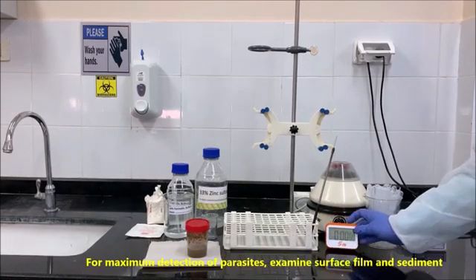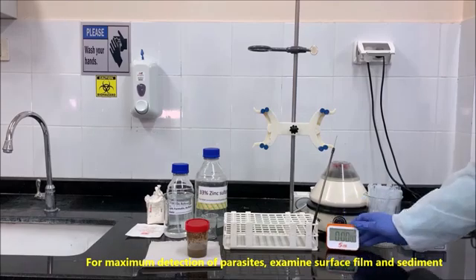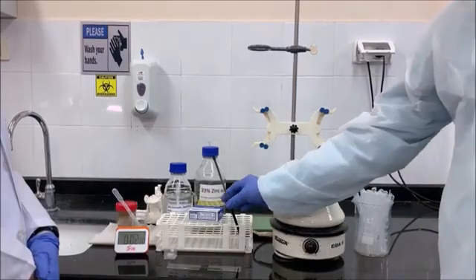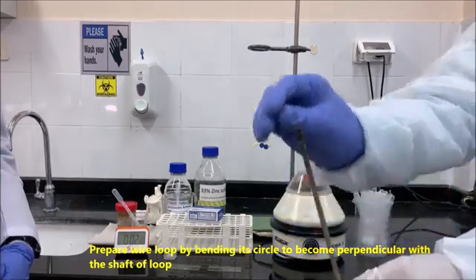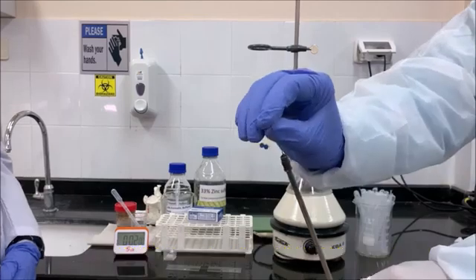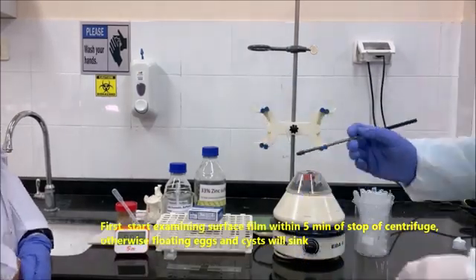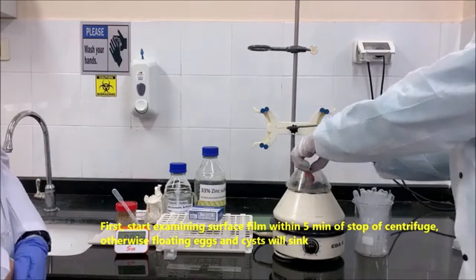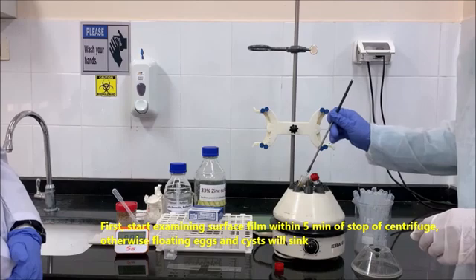For maximum detection of parasites, examine surface film and sediment. Prepare wire loop by bending its circle to become perpendicular with the shaft of the loop. First, start examining surface film within 5 minutes of stop of centrifuge. Otherwise, floating eggs and cysts will sink.